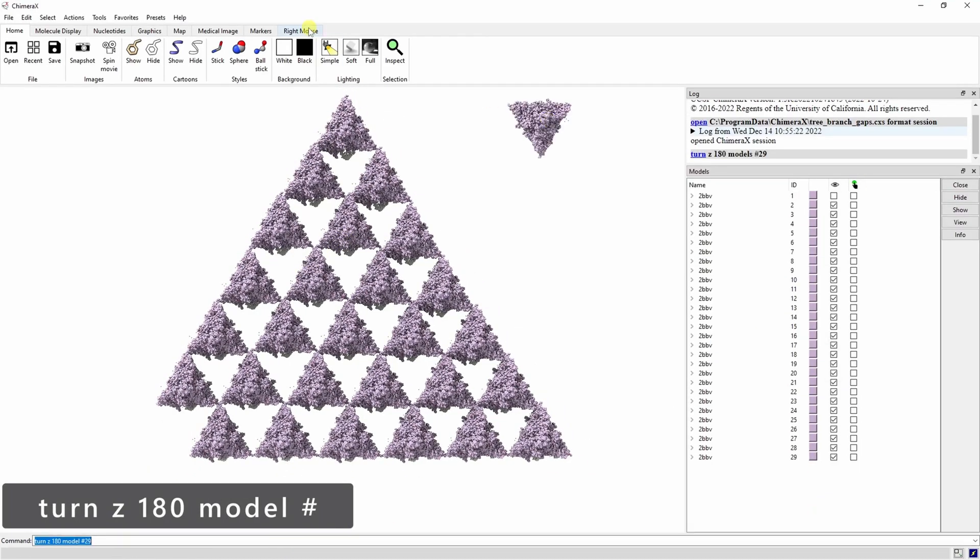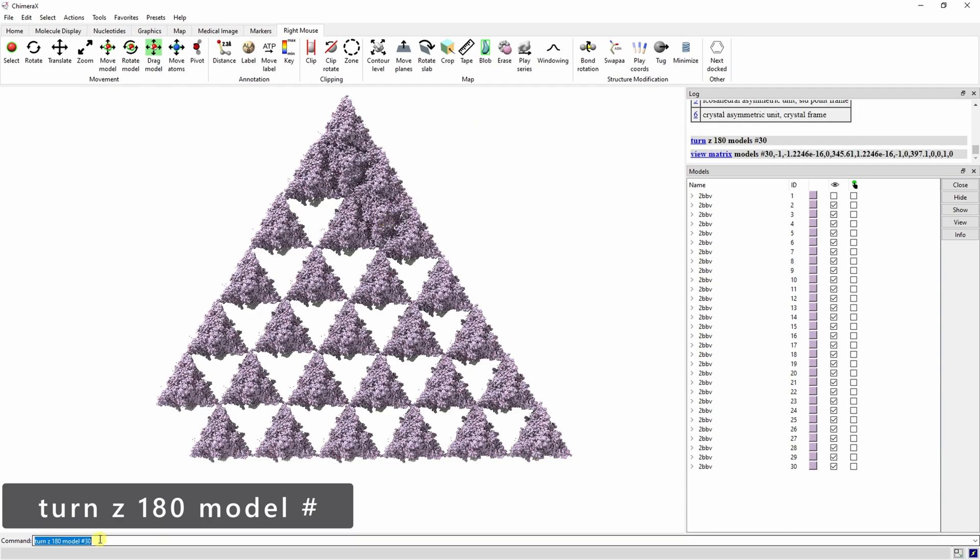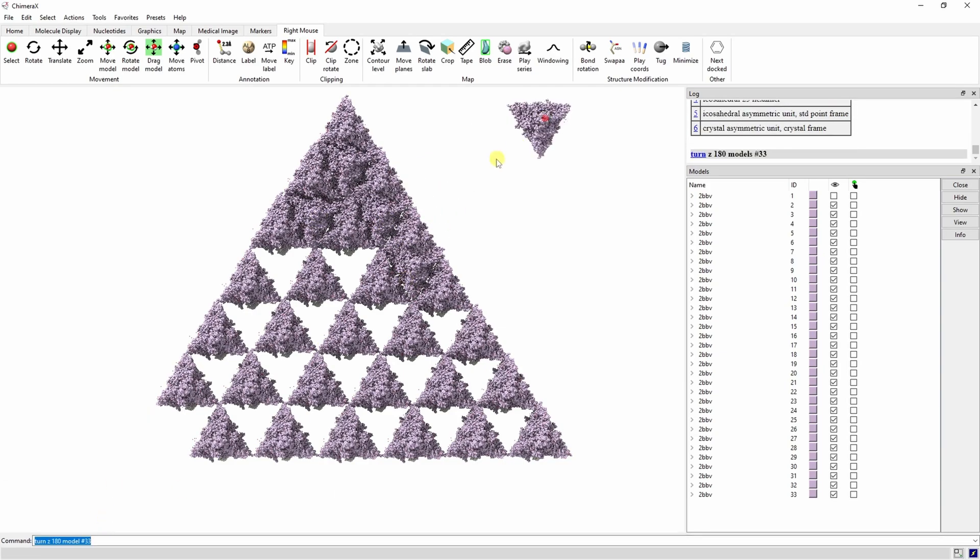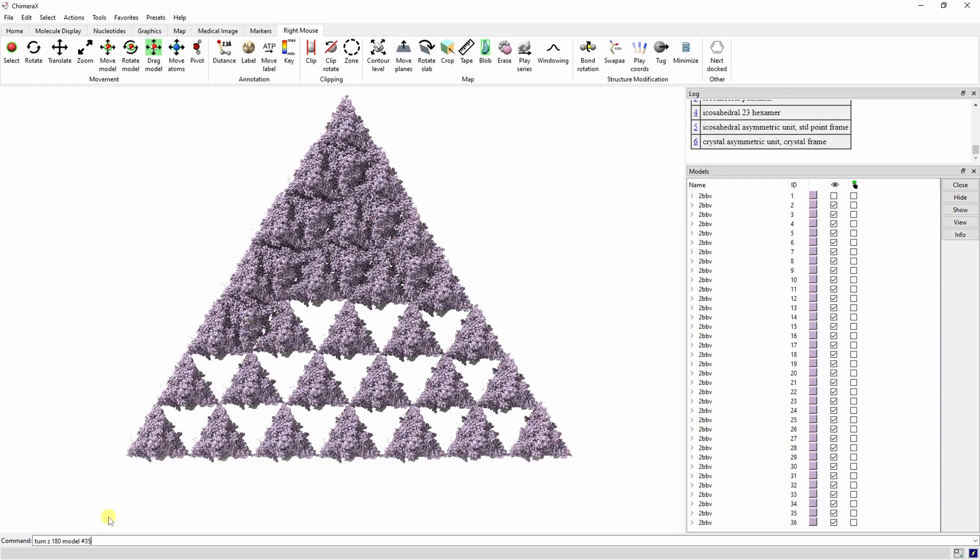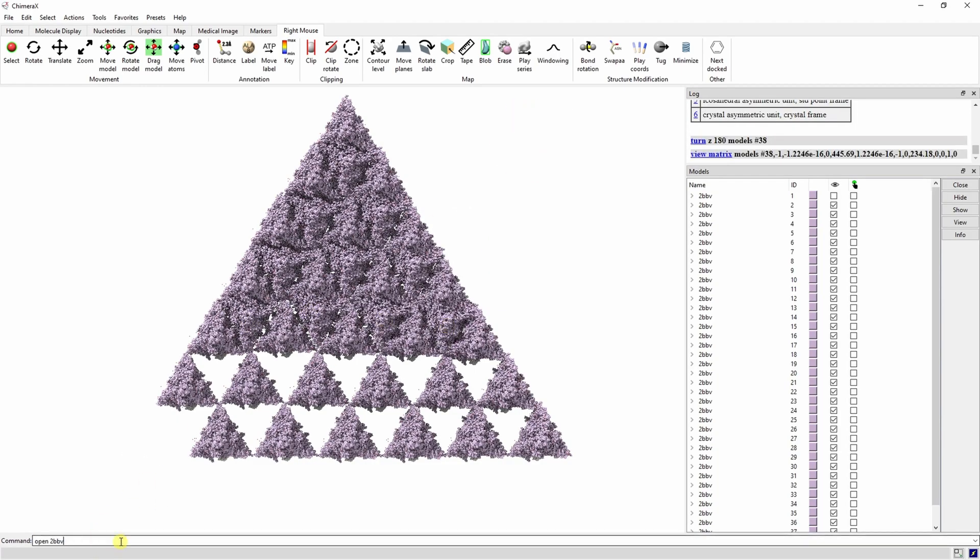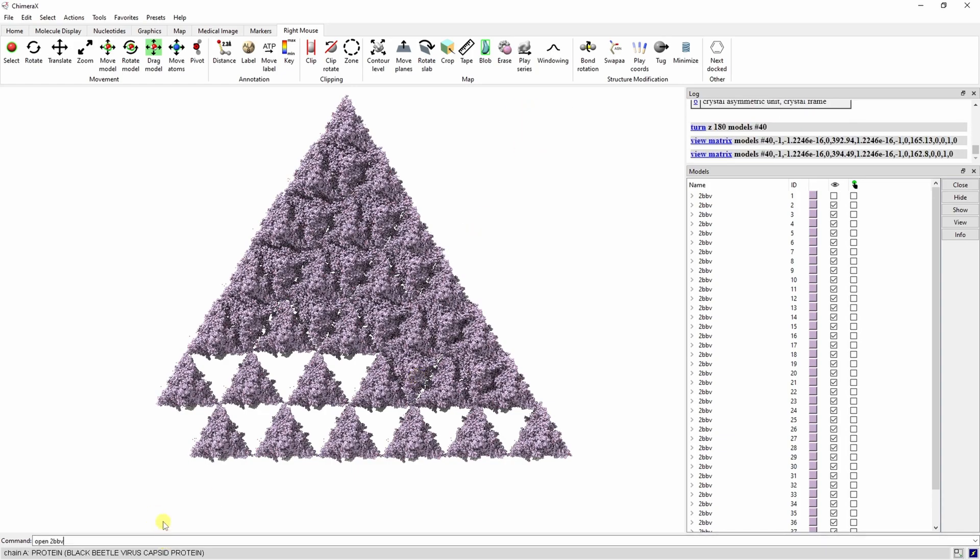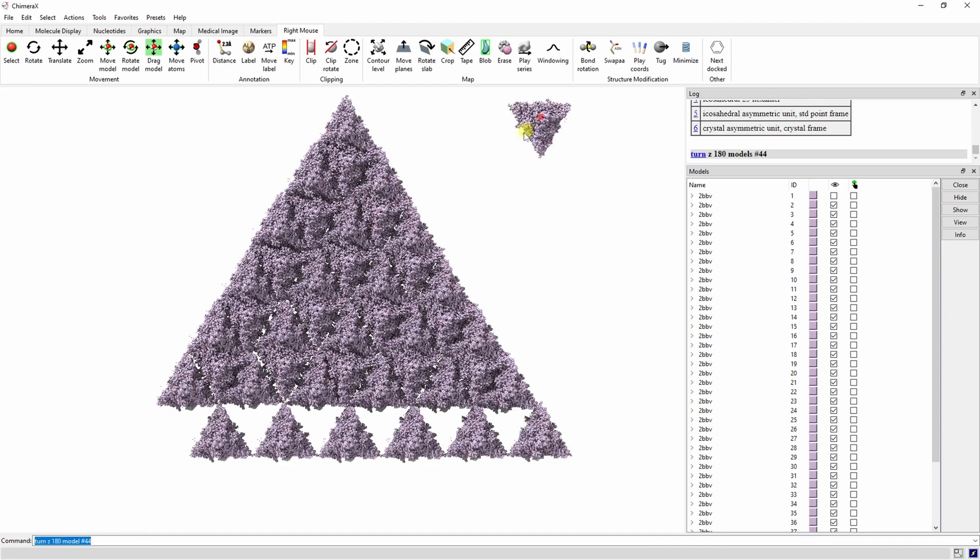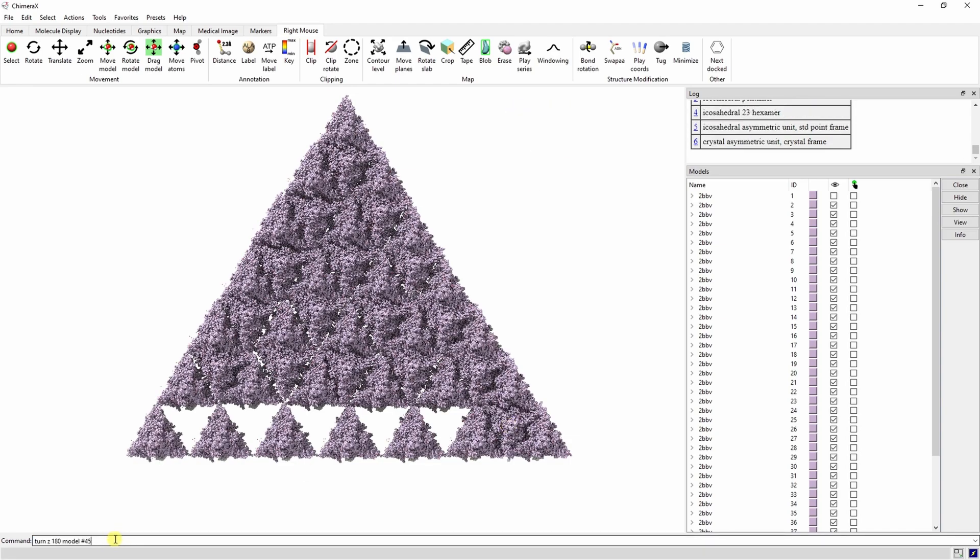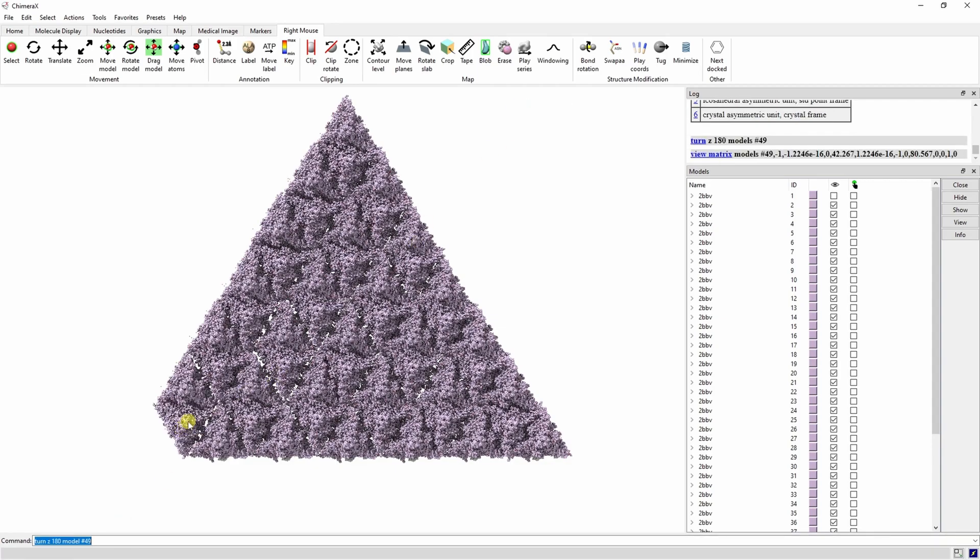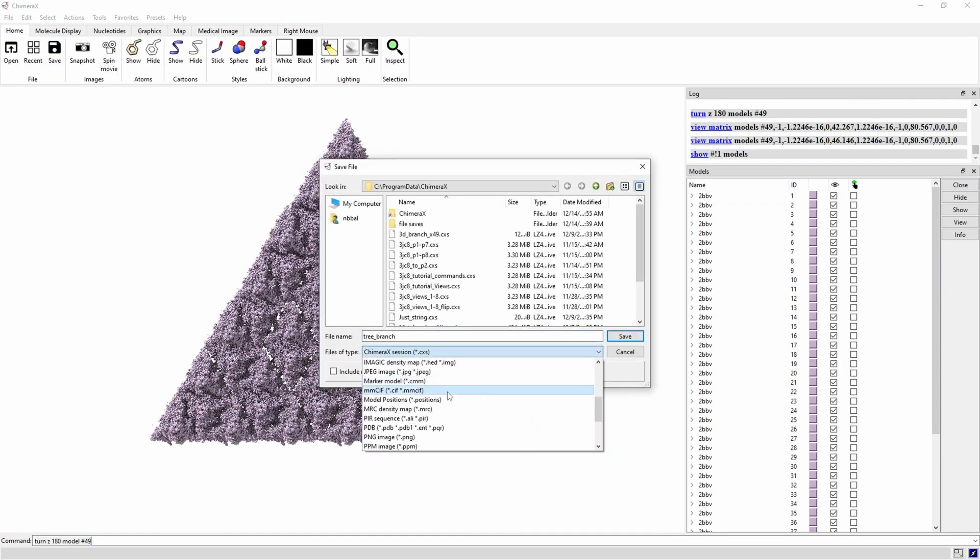Now that we have the general shape, we can fill in the gaps by flipping the next proteins upside down with the turn z180 command and specifying which model you're flipping. Once we're finished, we can save this as a PDB as well.